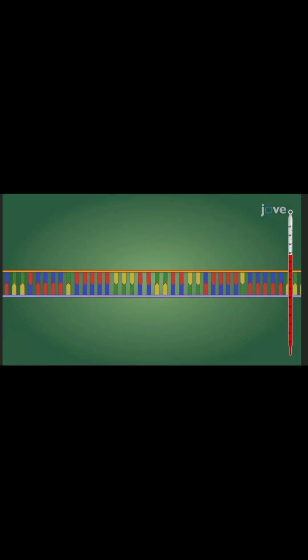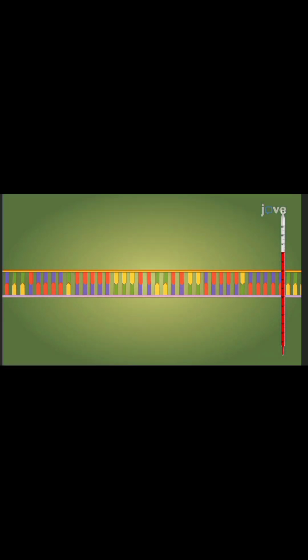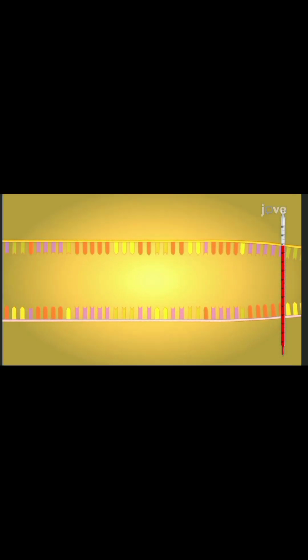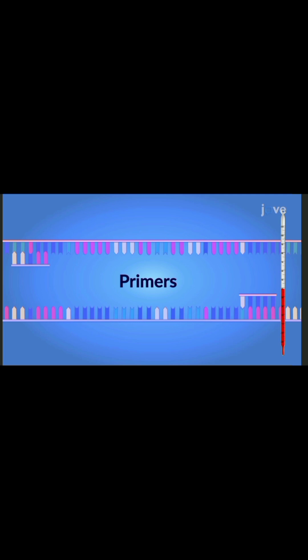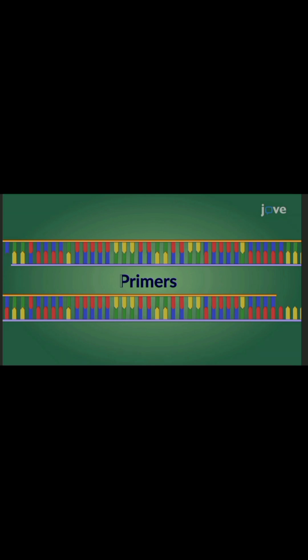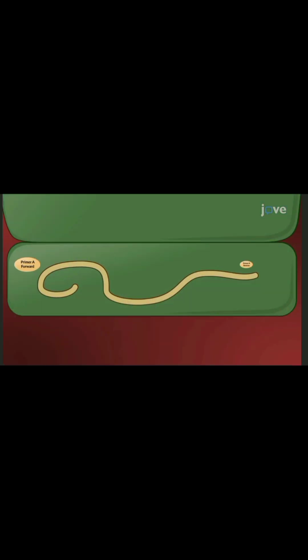PCR is a commonly used molecular biology method, consisting of cycles of denaturation of the double-stranded DNA template, annealing of universal primer pairs, which amplify highly conserved regions of the gene, and the extension of primers by DNA polymerase. While some primers amplify most of the 16S rRNA encoding gene, others only amplify fragments of it.